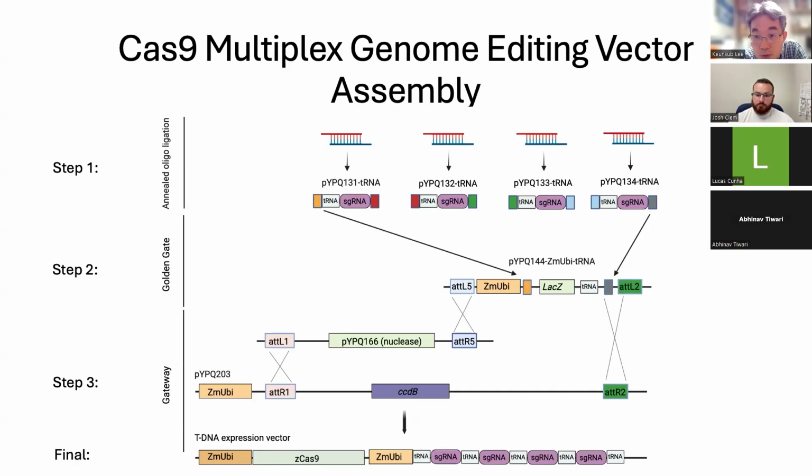Which strategy would you use to change promoters driving Cas12 expression to native promoters? So I guess it would depend on the species that you're interested in expressing Cas12. As mentioned, we really just drive Cas12, at least in monocots, with polymerase 2 maize ubiquitin, or in dicots with an Arabidopsis ubiquitin promoter.